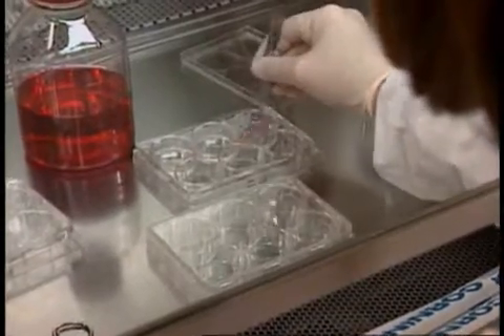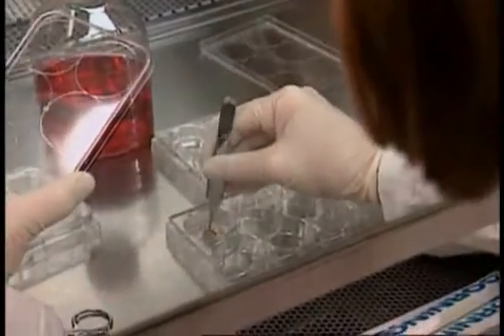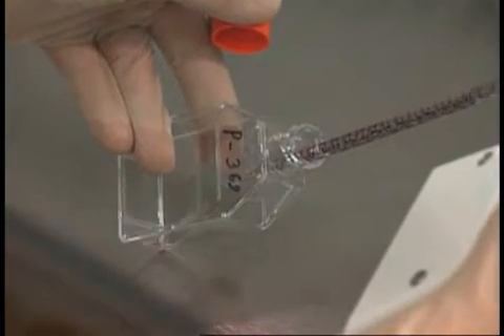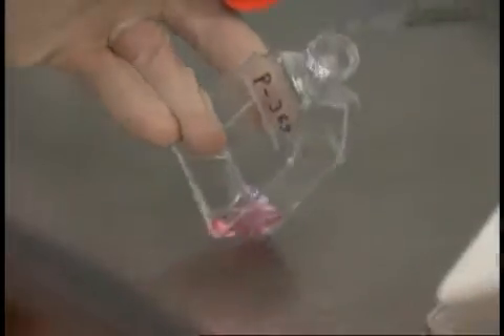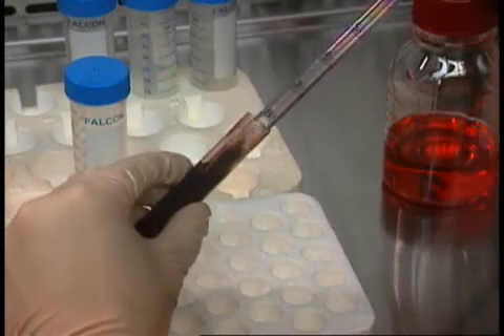Tissue culture work is an important component of the modern biology laboratory. This activity raises two concerns: the safety of the worker, because the cell line may contain an infectious agent, and the integrity of the cell cultures, because contamination may ruin the science.